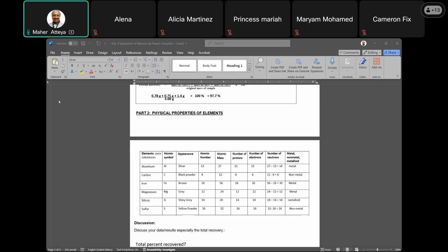The number of the vials are here. You get vial number 1, this is 2, this is 3, 4, 5, 6. Some of them look like the hospital blood vials when they take your blood for testing in the lab.